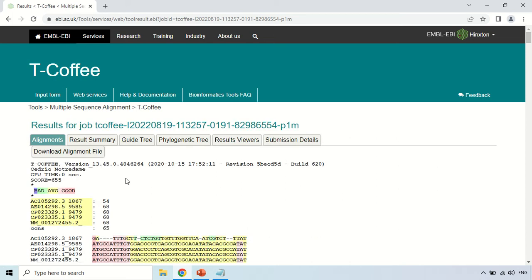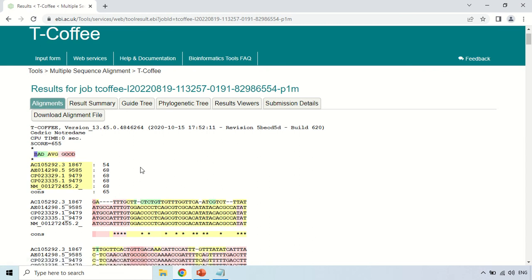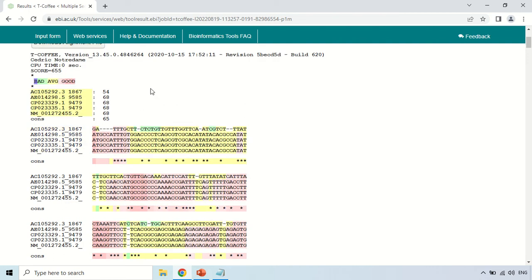Now the results are in front of us. These are some sections — the first is Alignment. Here is the T-Coffee tool name and version. In this section, there is color coding to help you understand the alignment. Where sequences are strongly aligned, they are represented in light pink; where they are not strongly aligned, they appear in light yellow; and where alignment is very poor, they are shown in light green or blue. I have taken 5 sequences, and these are their accession numbers.